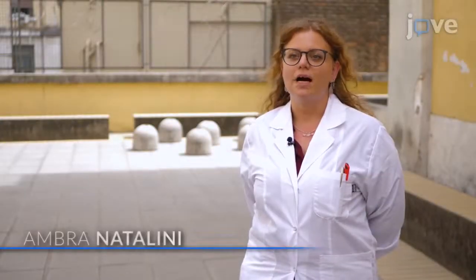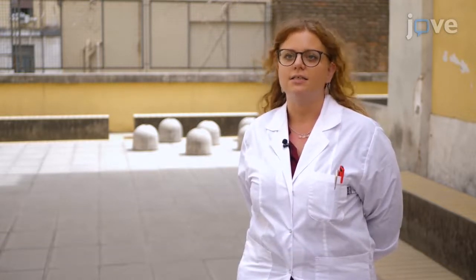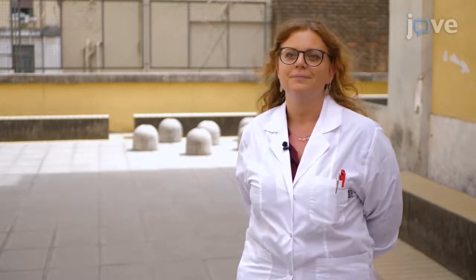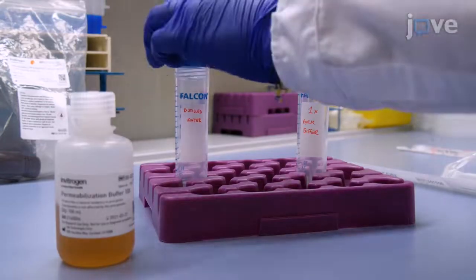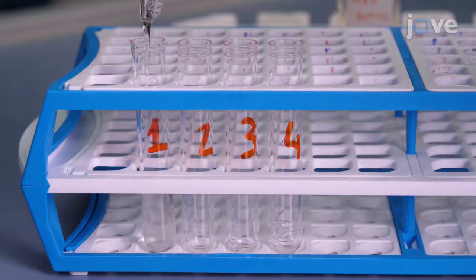Our protocol provides a practical approach by which mouse spleen and lymph nodes can be used to reflect the dynamic of T-cell response, rather than providing CD8 phenotypic snapshots. Our technique sensitively detects antigen-specific CD8 T cells that are engaged in an ongoing response.